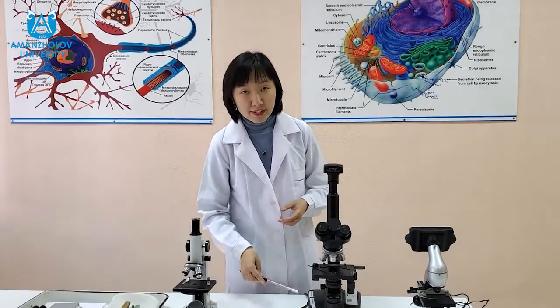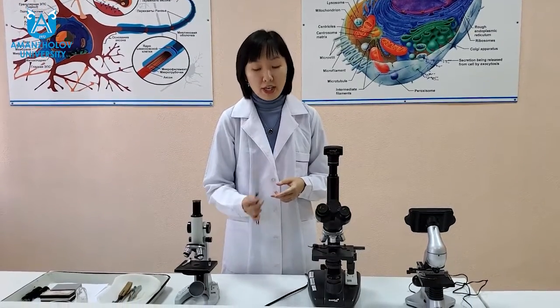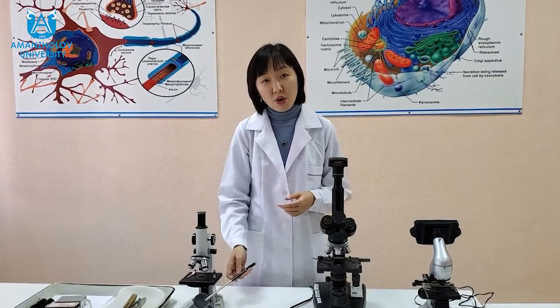The microscope device includes a tripod base, which is the main structural and mechanical unit of the microscope. The tripod consists of such blocks as a tripod or shoe and tube holder. The tripod or base is the block on which the entire microscope is mounted. In a simple microscope, the illuminating mirror is mounted on the base. In more sophisticated models, the lighting system is built in, with or without a power supply.